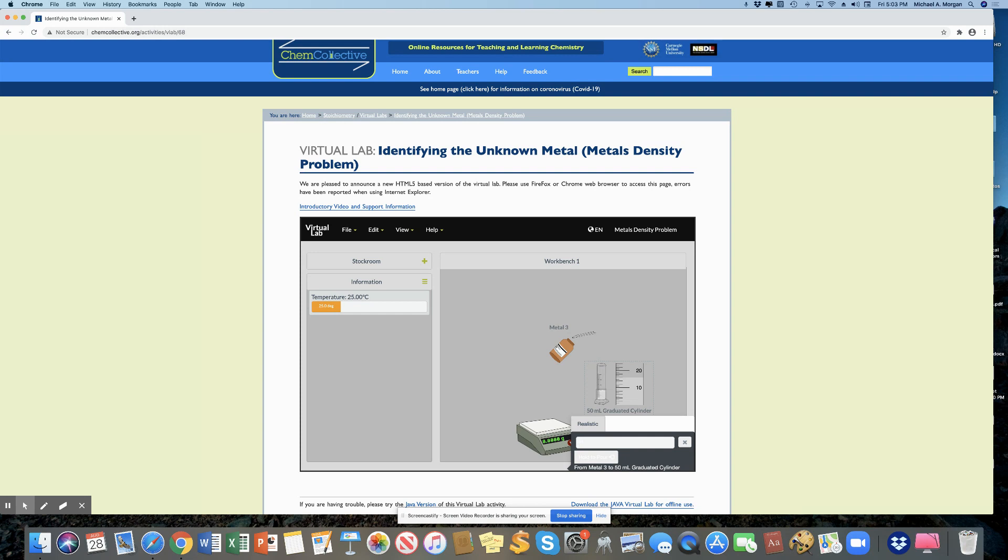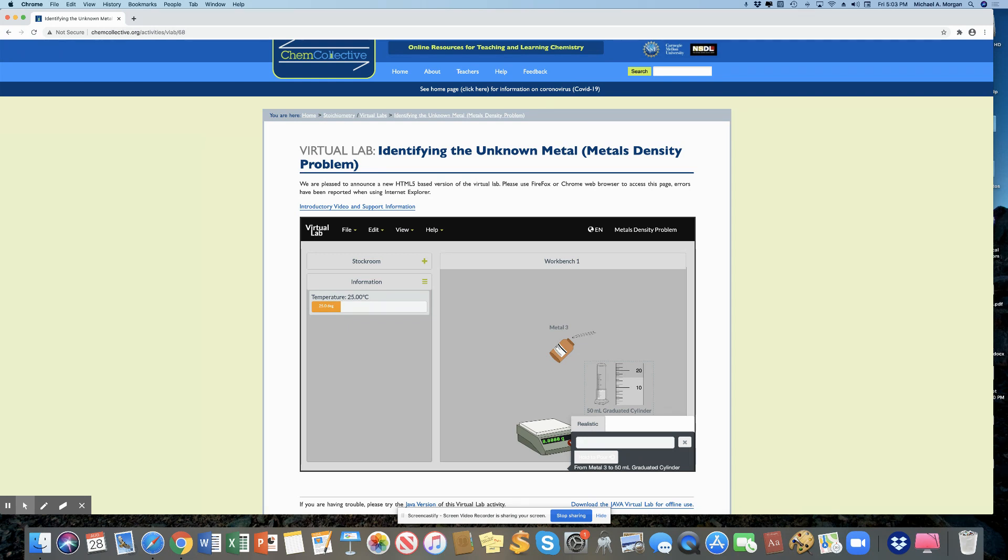Now this is really crucial. You have to write down the volume at this point. If you close this by hitting that little X before you've written down that volume, you're not going to be able to get that volume again. So this number is definitely between 10 and 20 milliliters.